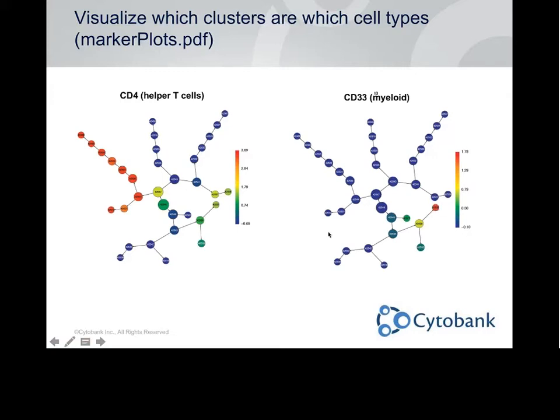However, even though this looks like a SPADE tree, there's one important difference. From here, you can see that it looks like a series of conjoined nodes, just like a SPADE tree would. However, these are hierarchical. Just like in a gating hierarchy, we have a series of nodes here.